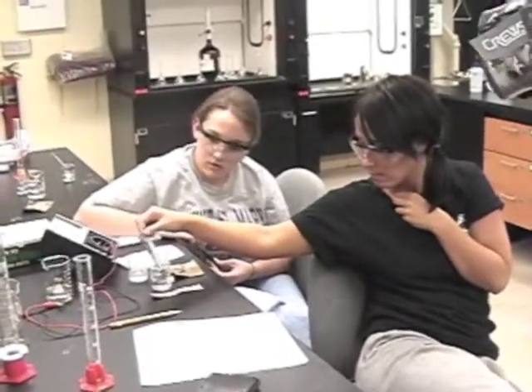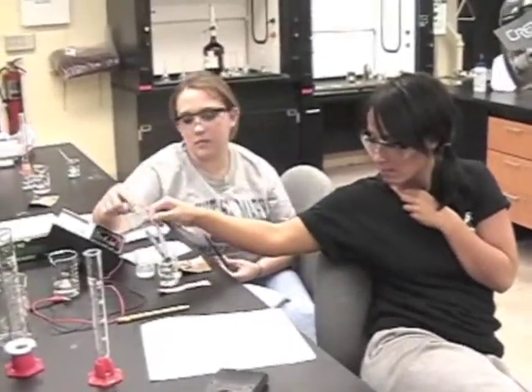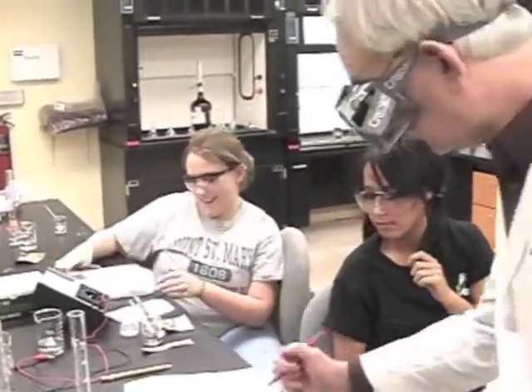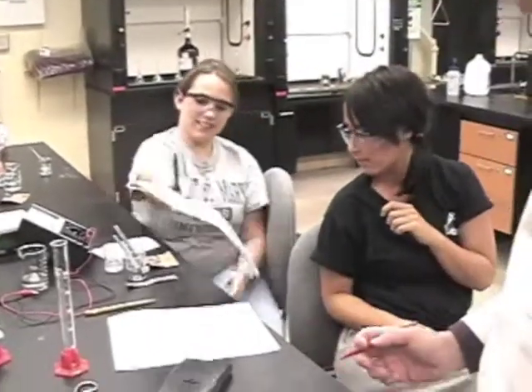See, in the other one you have there, you're making zinc nitrate as a salt. And that would be soluble, so all you're seeing is the metal on that one. You're seeing the stripes of the metal, because the salt is soluble in that one. Good job, Danielle. Good job, Tiffany.